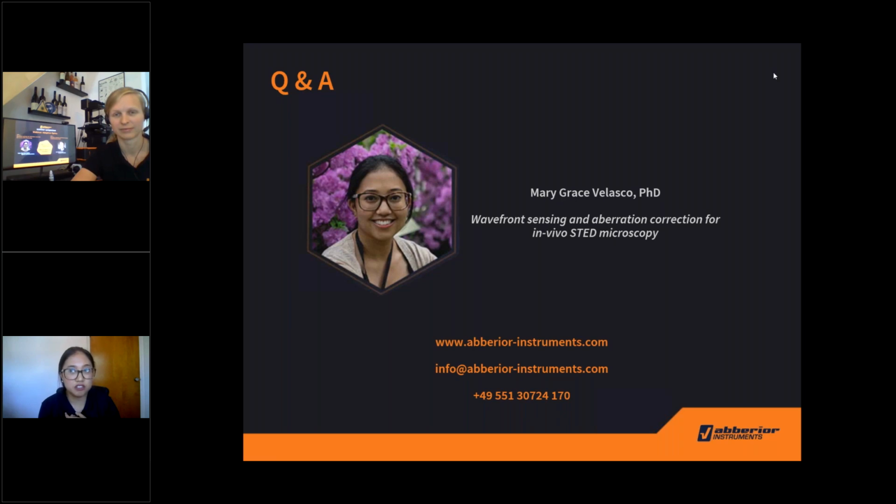It's a 2018 Nature Methods paper where a colleague did carry out quantitative photo damage experiments. In their recommendations, they include the use of fast laser scanning and also the use of far red excitation and depletion wavelengths, both of which were key features of the design of our microscope. Sorry that it's not a very quantitative answer, but we also found it promising that during our in vivo experiments, especially on our multi-day ones, whenever we imaged the same area again after a couple of days, the same spine could be found. But yes, I definitely agree that included in the next steps should be some sort of quantitative photo damage experiment.